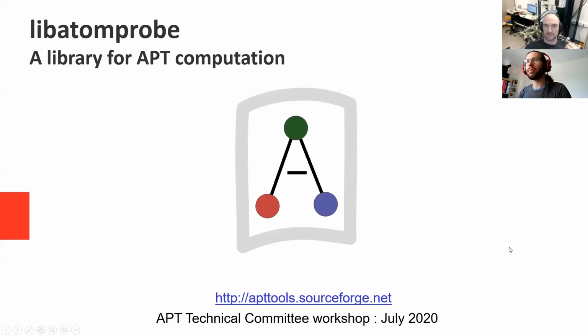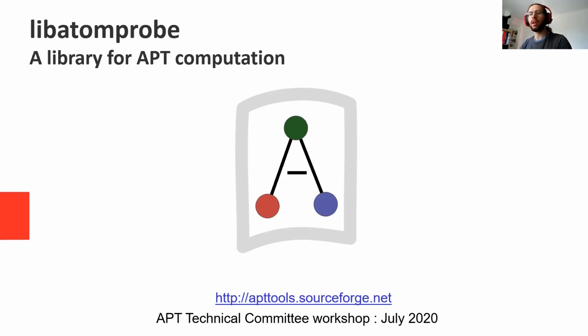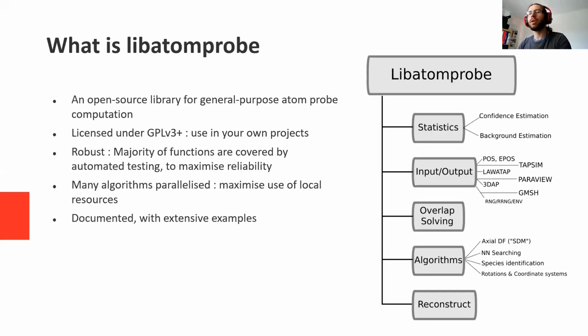I'm now going to put my Libatomprobe hat on and talk to you about the C++ library that Dan Haley has developed and that I'm also a co-author on. So what is Libatomprobe? It's an open source library for general purpose atom probe computation. So what does that mean?